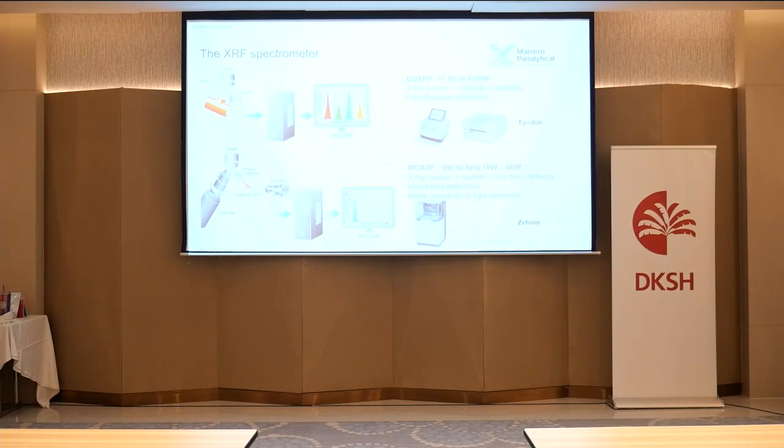Typically, ED-XRF can measure from sodium to uranium, but some special kinds of ED-XRF can analyze from fluorine to uranium or even down to carbon. For ED-XRF, you don't need high wattage because it is measuring all the elements simultaneously. So the measurement is really fast. Even low power, from 5 to 50 watts, is good enough for ED-XRF.